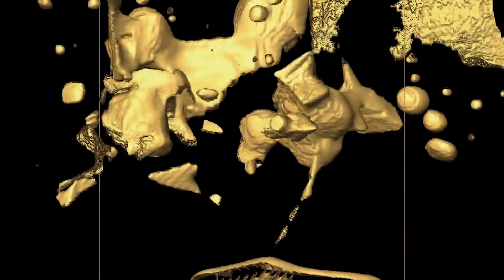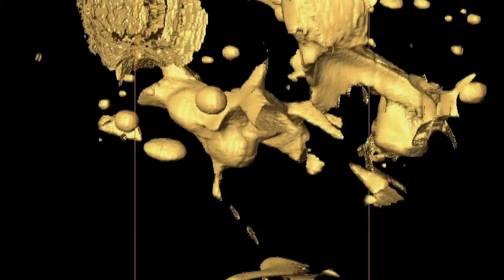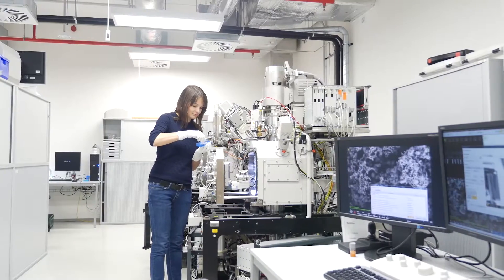And not only that, a customer can use applications that speed up and facilitate work, both in research and development and in industry. For example, 3D reconstruction, analysis of structure, composition, and form.